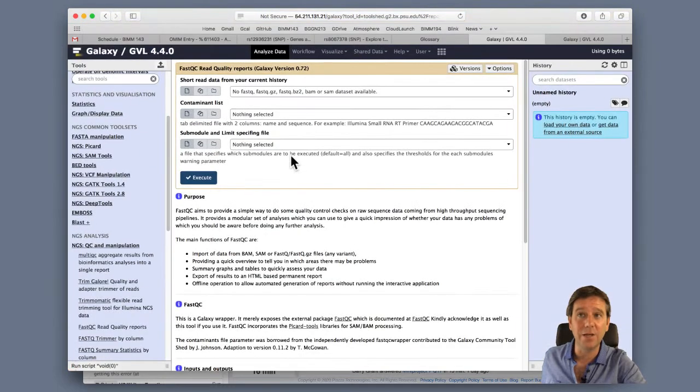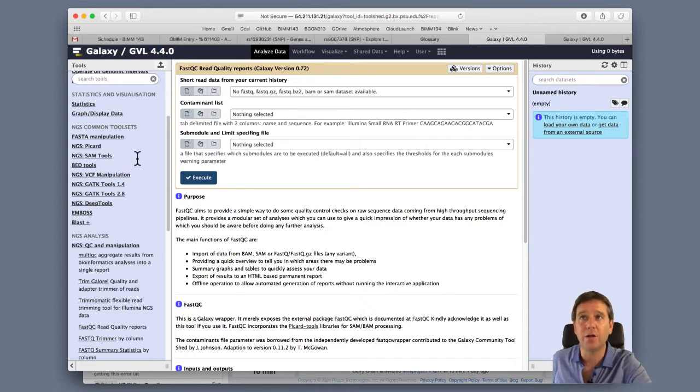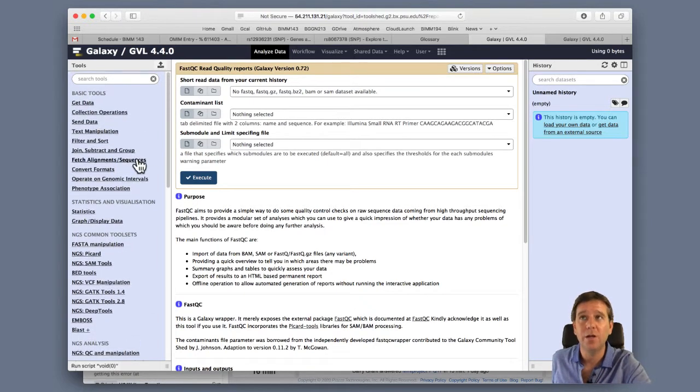So we need to get some data. So let's go and get some data, and that's the data that I give on that class website, those FastQ files. We'll talk about what those FastQ files are in just a second. They're from the sequencer, but let's get them up here. Let's get them running.